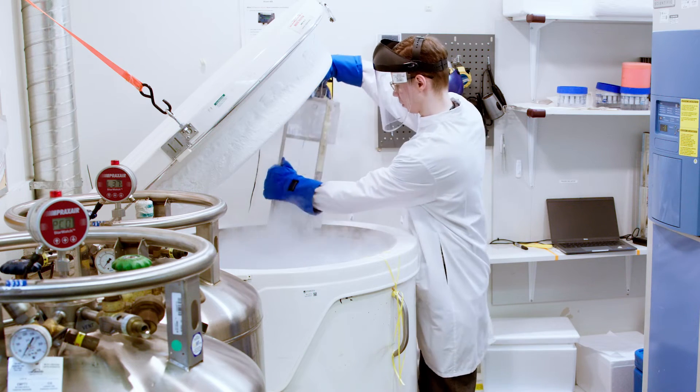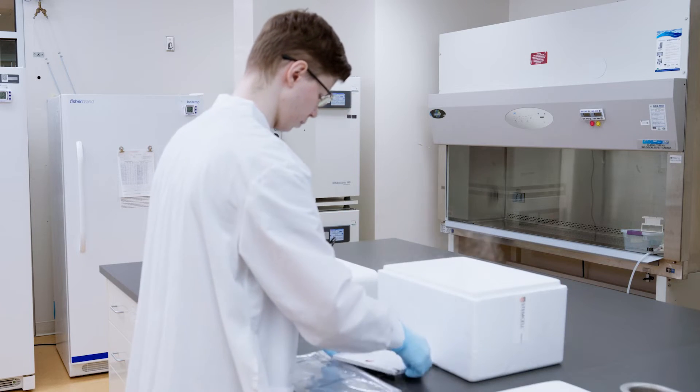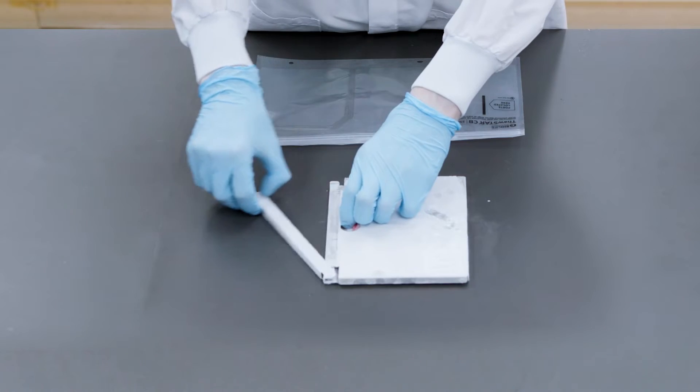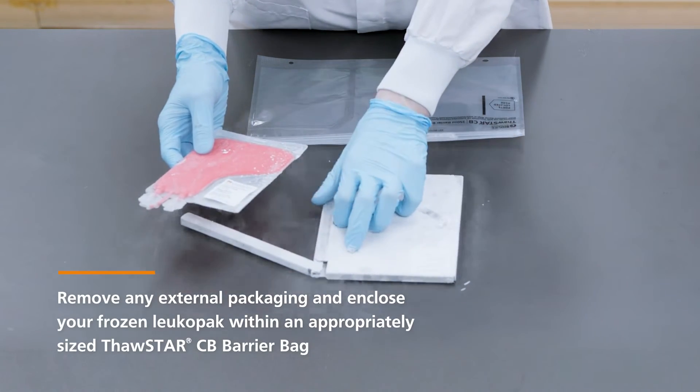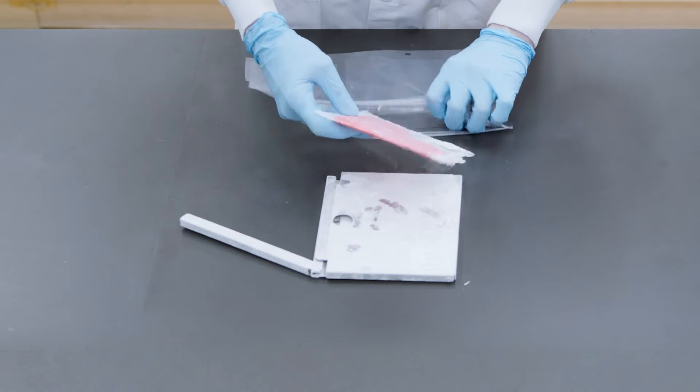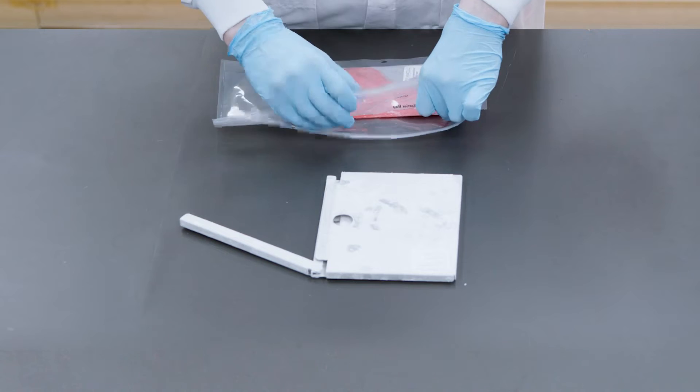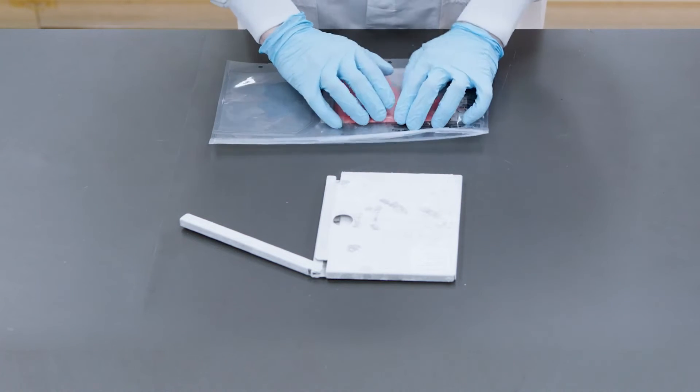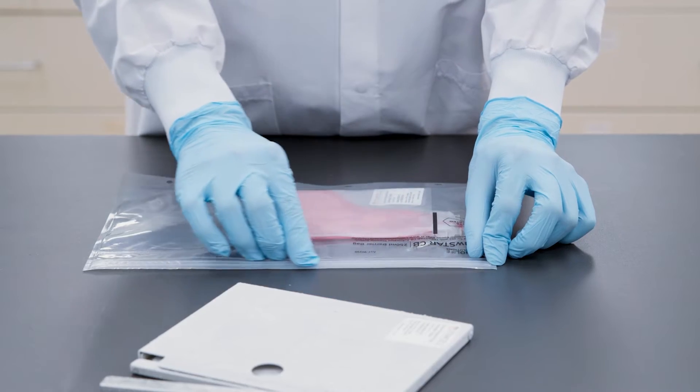When you're ready to begin, carefully remove your frozen Leukopax from storage and bring it to your workstation. Be sure to remove any external packaging and enclose your frozen Leukopax within an appropriately sized Thawstar CB barrier bag. The barrier bag helps reduce the risk of sample loss and contamination throughout the process. Remove all excess air and seal tightly to ensure proper positioning and alignment, allowing for optimal thawing.